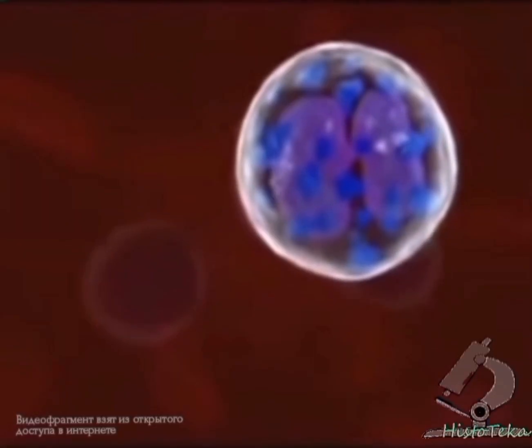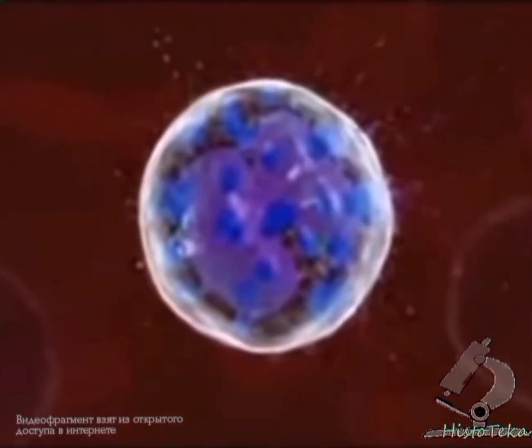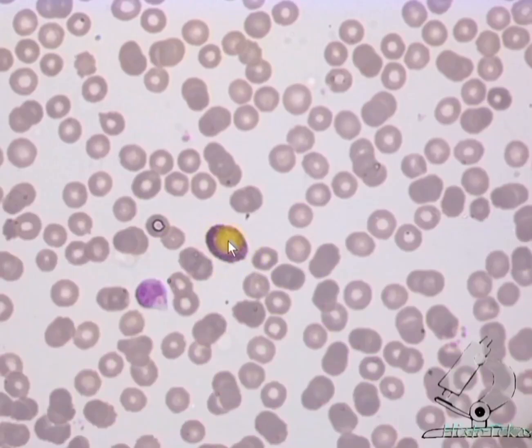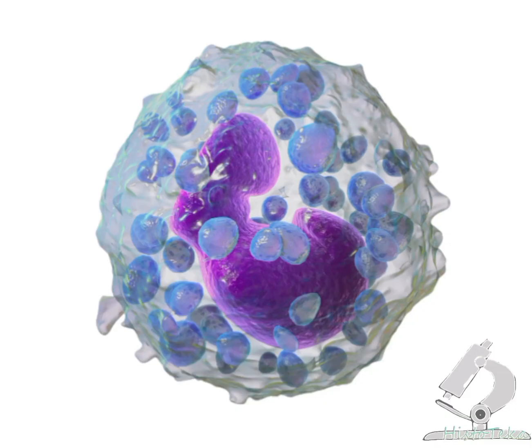Well, the third type of granulocytes in terms of frequency is basophils, 0.5 to 1%. They contain large basophilic granules which fill almost the entire cytoplasm and mask the nucleus. The nucleus is weakly lobed and difficult to see behind the numerous large granules. The specific granules of basophils include histamine and heparin. Functions of basophils: local inflammatory and anticoagulant.